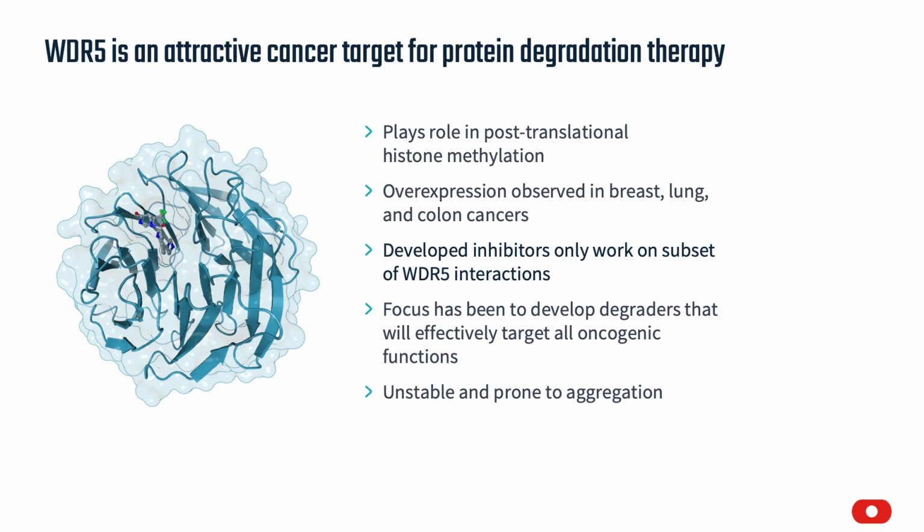WDR5 inhibition has been proposed as a potential therapeutic strategy for cancer treatment, and shown here, you can actually see a crystal structure of WDR5 that was co-crystallized with an inhibitor. The limitation in applying the small molecule inhibitor approach is that WDR5 with one active site blocked can still participate in a number of different protein-protein interactions. To combat this issue, our collaborators at the SGC developed a protein degradation strategy.